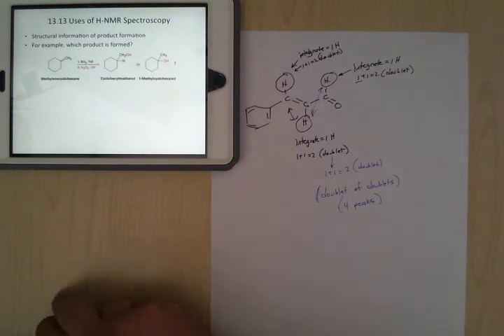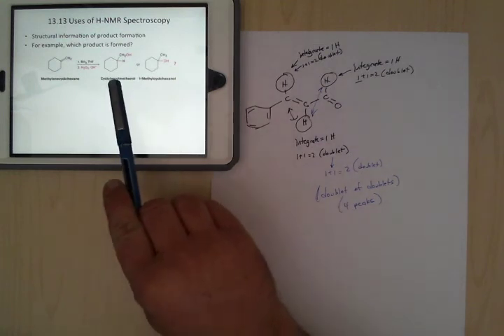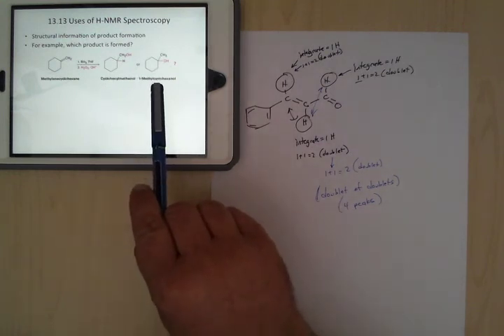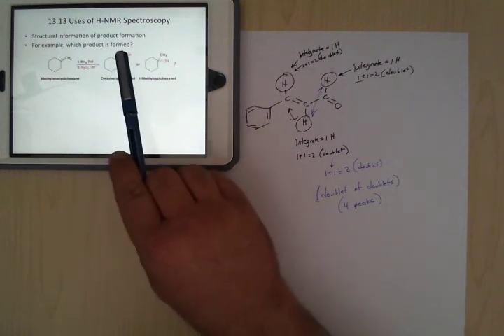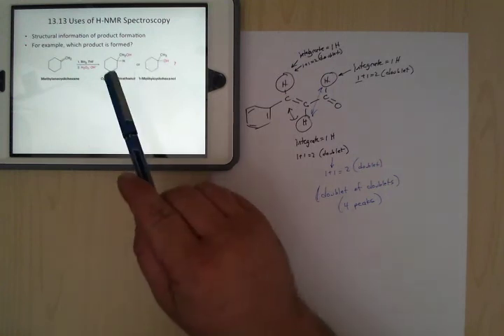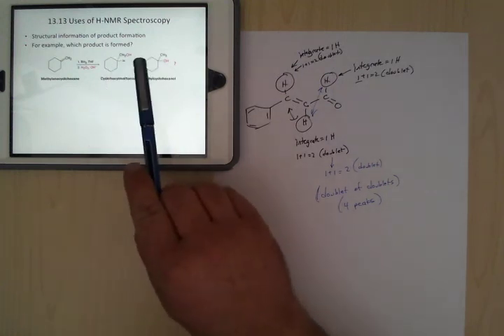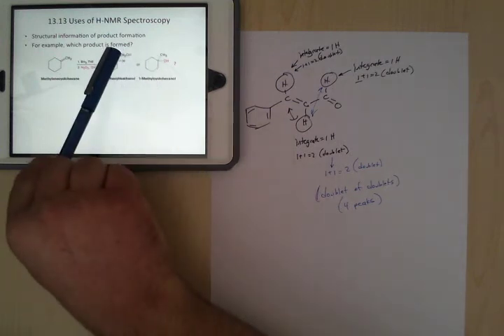So again, how do we figure this out if we do this experiment? If you look at this versus this, this one is going to have CH2s all around here, and that's not going to change much, but this is a CH. You're going to have the CH here, so you can have a CH integration, and this one is going to be another CH2.